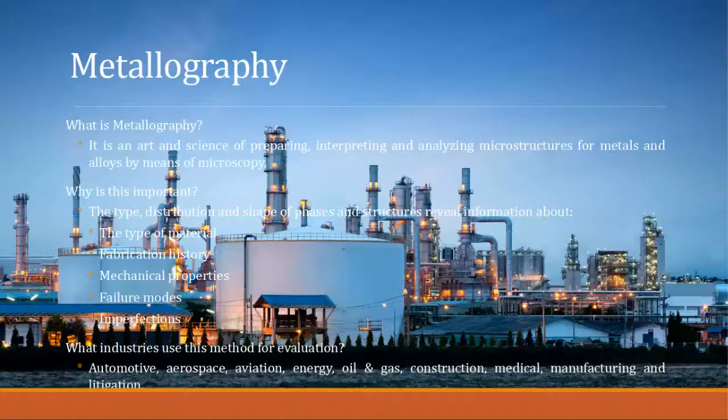So what is metallography? Well, I look at it as an art, but it's also the science of preparing, interpreting, and analyzing microstructures for metals and or other material systems by means of microscopy. And that microscopy could be either your light microscopes, scanning electron microscopes, more than anything else. And if anybody ever questioned why this technique is important, well, it's going to essentially tell you the structure of the material. It's going to give you the history of the material.